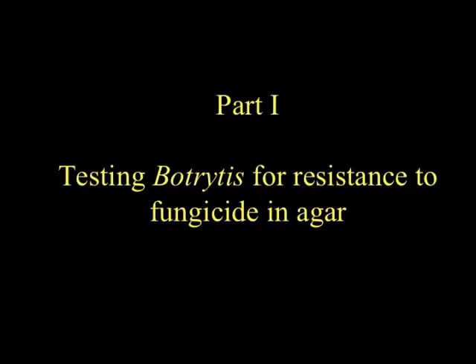We are going to conduct two experiments in order to test the gray mold fungus, Botrytis cinerea, for its resistance and sensitivity to the fungicide fenhexamide. This video covers part 1 and another video covers part 2. In part 1, we're going to test the fungus in agar plates, amended with various concentrations of the fungicide.